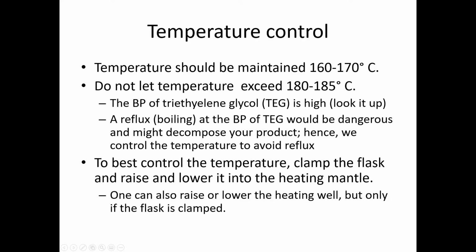So the best way that you can control a boiling reaction is to really clamp the flask and then raise it and lower it onto the heating mantle when necessary. So if it gets too hot, just make sure to lift up the clamp, and if it gets too low, you drop it right back down.